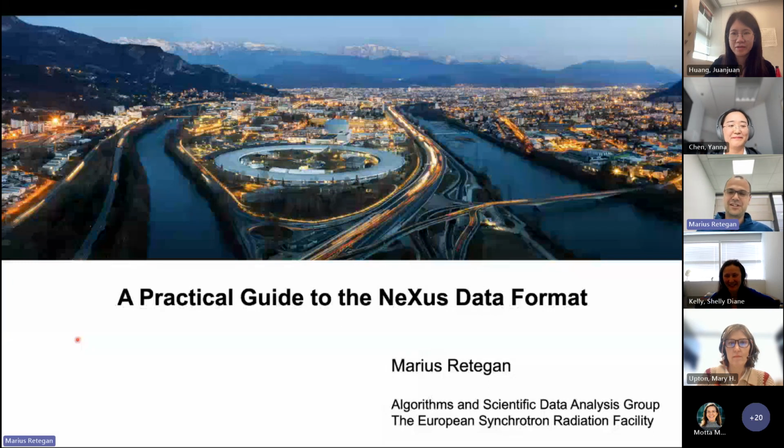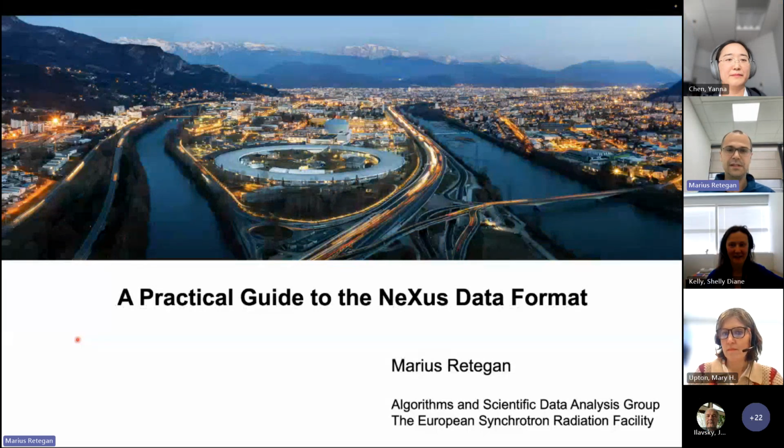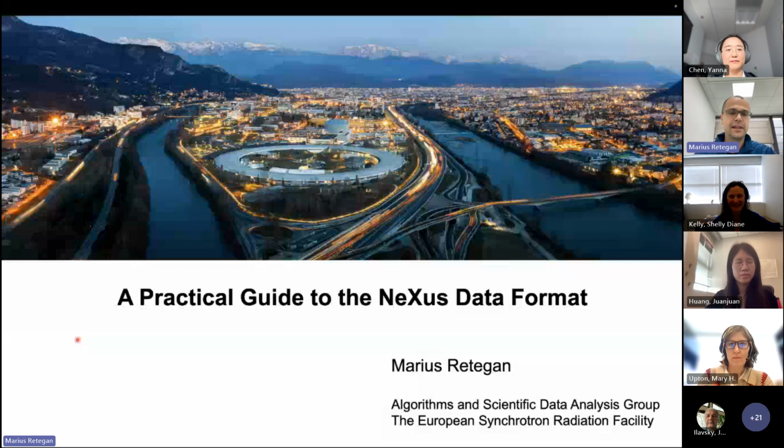Yeah, thank you for the introduction, Shelley, and thank you for having me today. So this presentation is based on a small demo that I gave about 2 months ago at one of the group meetings where we are trying to establish a new NeXus definition for X-ray absorption spectroscopy. But since that demonstration was based on the assumption that everybody was familiar with HDF5, which maybe is not the case here, I want to start a little bit by introducing some of the formats that are used in X-ray spectroscopy and a few details about it.